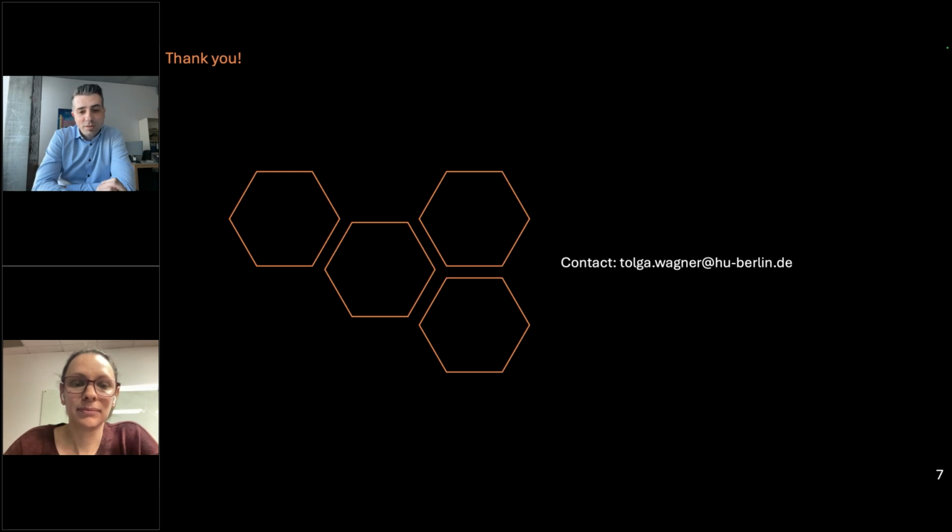So independent of different thick amorphization layers, we found that the altered projected potential is going micrometers into the specimen. And what we are now trying to do in collaboration with IKZ is to make use of their new plasma FIB and hope that we can get rid of the ionization problematic with this approach. I hope this was okay.